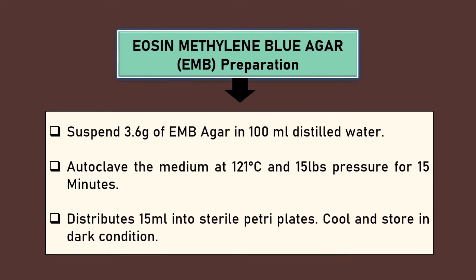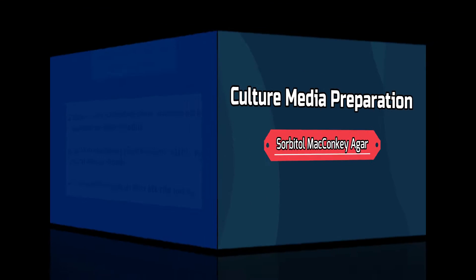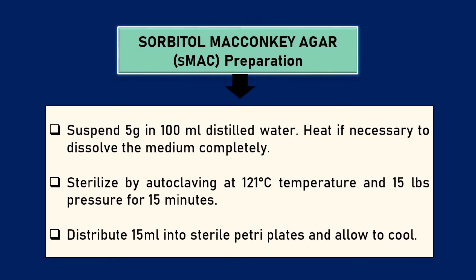To prepare EMB agar, dissolve 3.6 grams of dehydrated media into 100 ml distilled water. Autoclave at 121 degrees Celsius and 15 pounds pressure for 15 minutes. Distribute 15 ml into sterile plates. To prepare SMAC, dissolve 5 grams of dehydrated media into 100 ml distilled water.